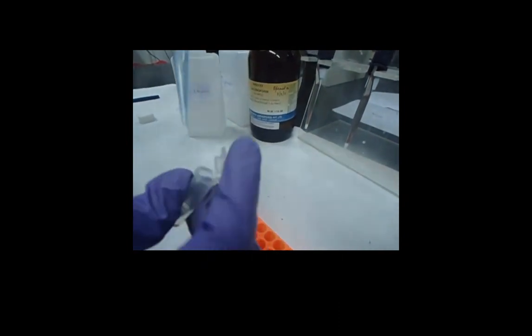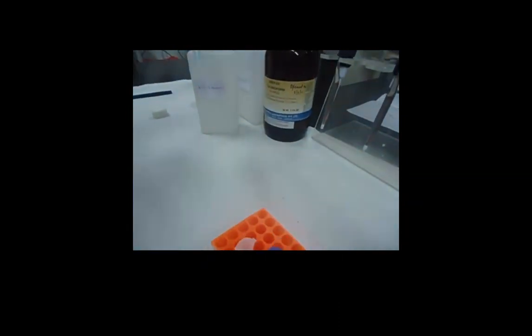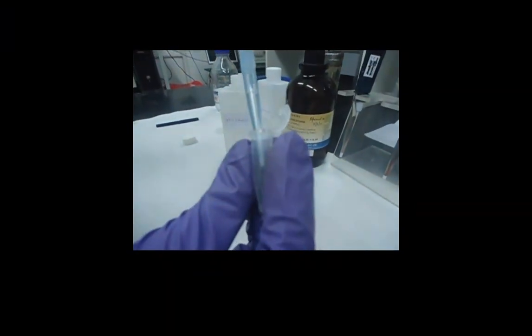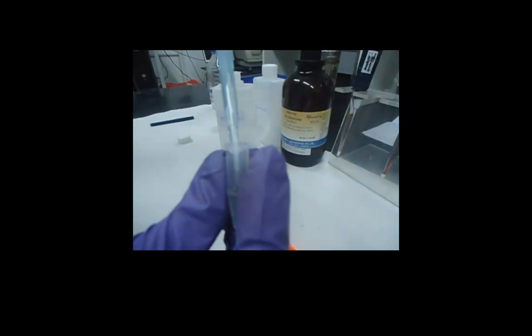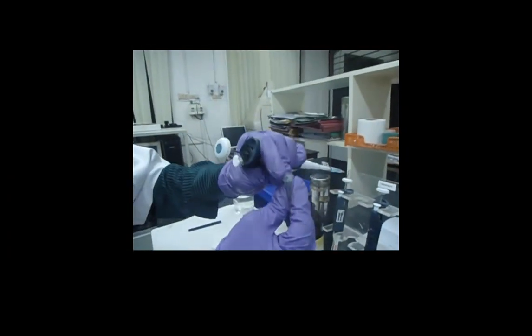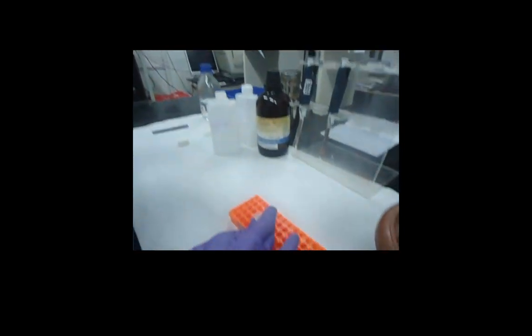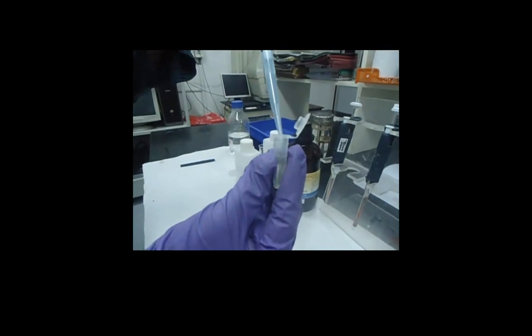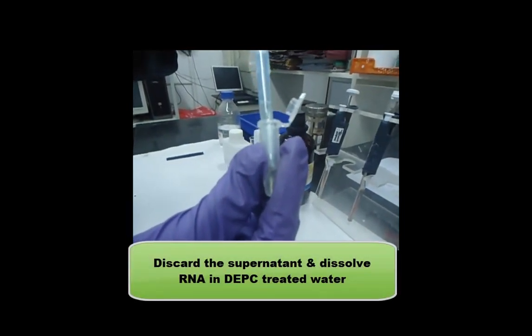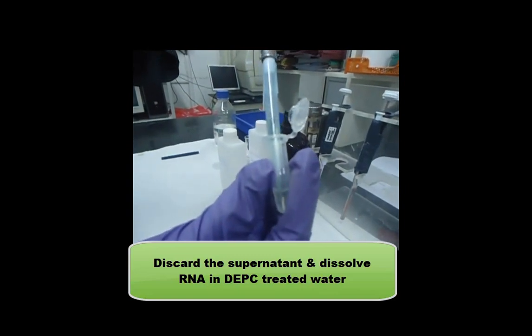Here the ethanol acts as a salt remover. Due to the DEPC treatment, it doesn't affect the RNA. And at last, discard the supernatant and dissolve the RNA pellet in DEPC treated water.